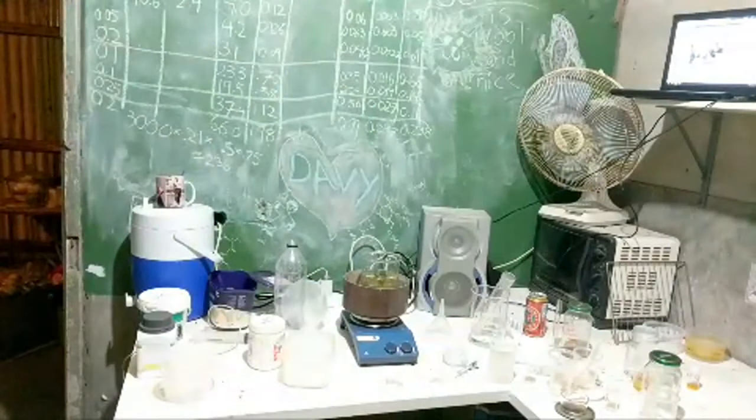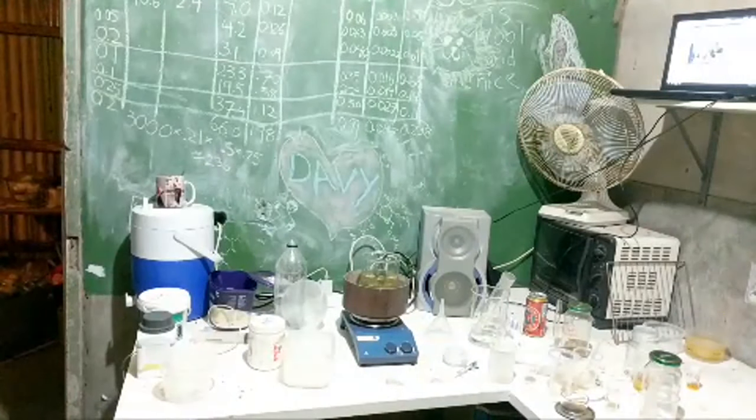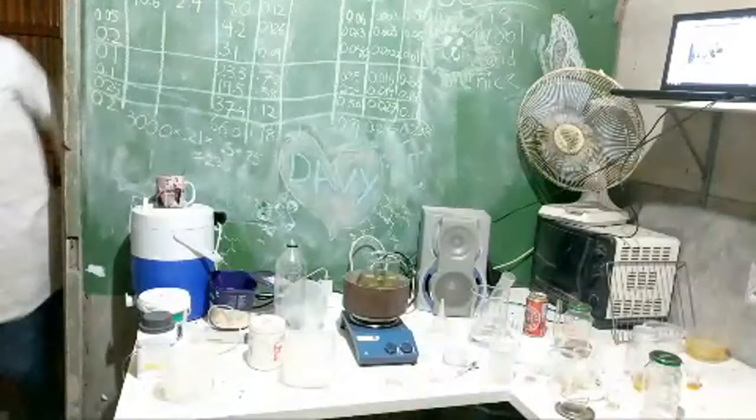Oh, thermometer. Fuck. This one is 0 to 200. Do I have 0 to 100? Nah. Oh, should use my thermocouple for this. That would be much better. This one here. Oh, fucking broke it. Oh, I'm a mess.